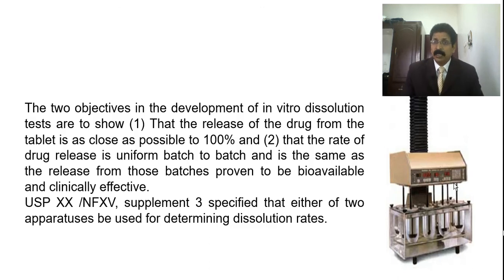See, for example, a tablet which you produced, it is 500 milligram of paracetamol or 100 milligram of diclofenac or 500 milligram ciprofloxacin, anything you manufacture or formulate, the dose is intended for the drug action. Am I right? So when you are preparing a tablet formulation, if it is denoted in the label claim as 100 milligrams, 100 milligrams should be released to the bloodstream and there should be action. So 100% release should be there, 100% dissolution of the tablet should be there. That is why we need this dissolution tester.